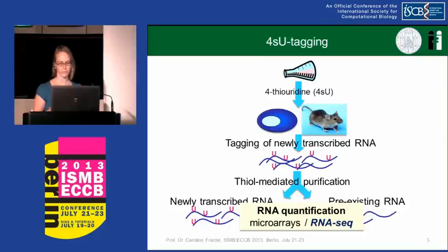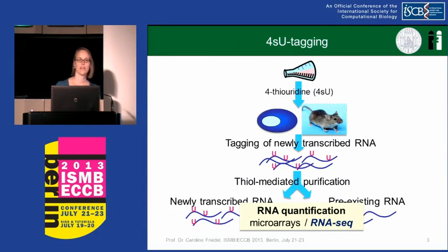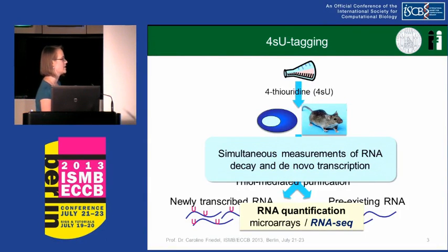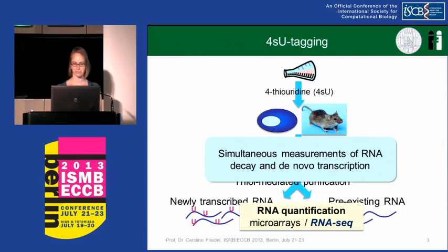Then you can quantify this RNA, both the newly transcribed RNA and the pre-existing RNA and also total RNA, either with microarrays, which is what we did previously, or using RNA-seq, and then it's 4sU-seq. So that's basically it. And this gives you simultaneous measurements of RNA decay and de novo transcription.